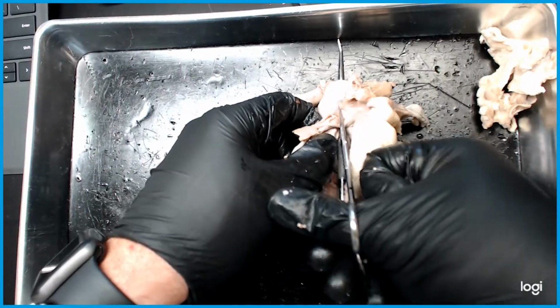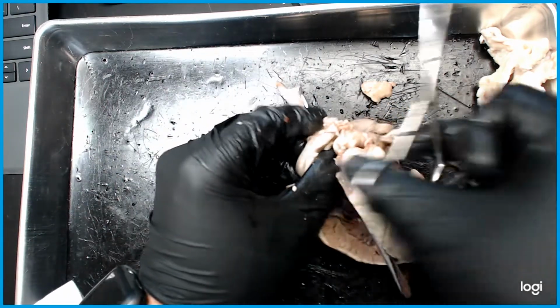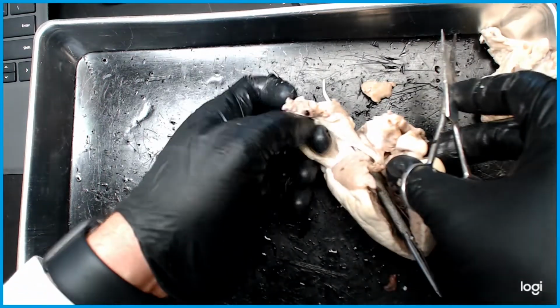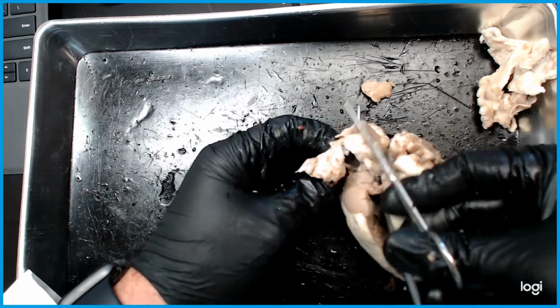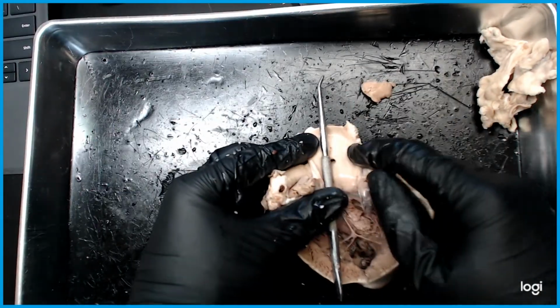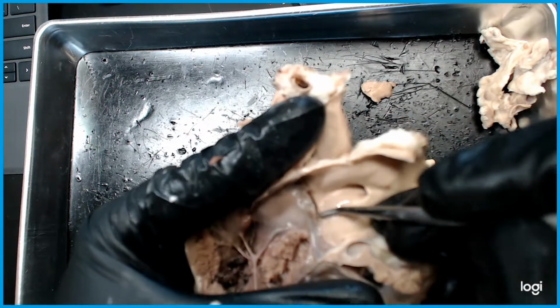And as we continue all the way to the top, let's see if we can separate this section. We were able to separate this section, so now we continue with the probe, follow through, all the way to the aorta. Now that the aorta is open, notice my probe is still in there, it's making a lot more sense. The aortic valves are right up here, right here. There they are. See these little flaps?